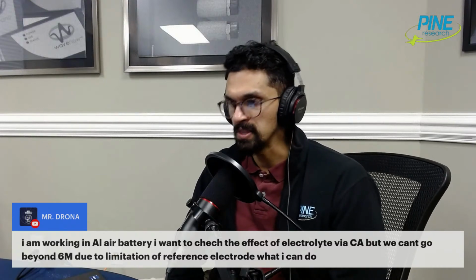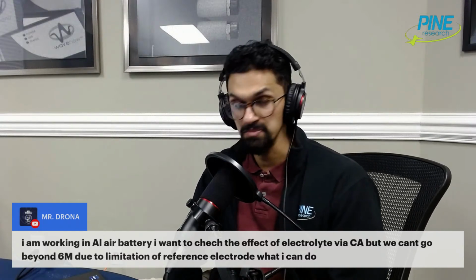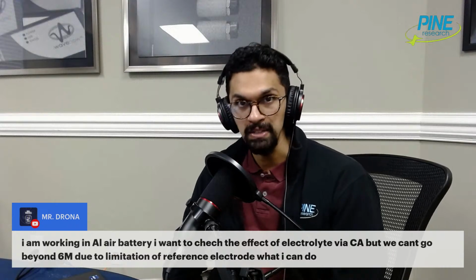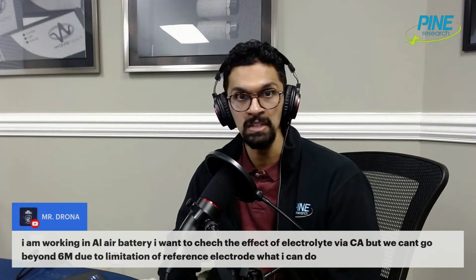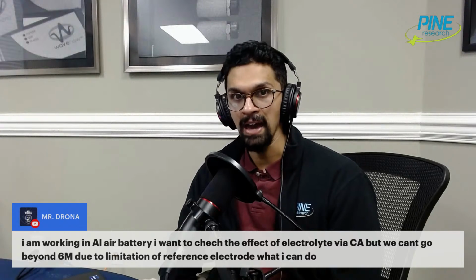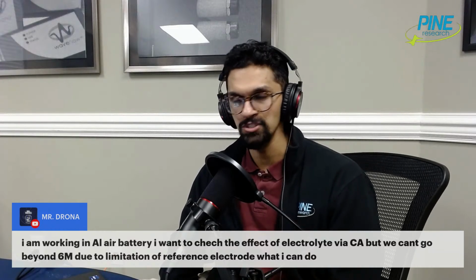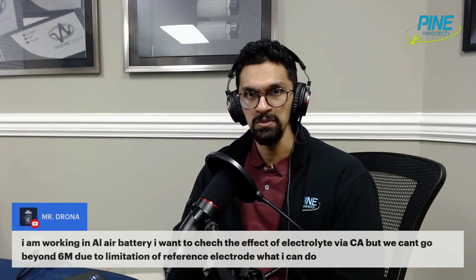So without knowing too much about batteries, this is my simple recommendation. There is something called an internal reference. You could use a piece of metal, for example, that does work in 6 molar electrolyte. It doesn't decompose, it doesn't change or anything like that. And then I would add a redox molecule into your system that hopefully does not affect or change the electrolyte. But you know the potential of that redox molecule.